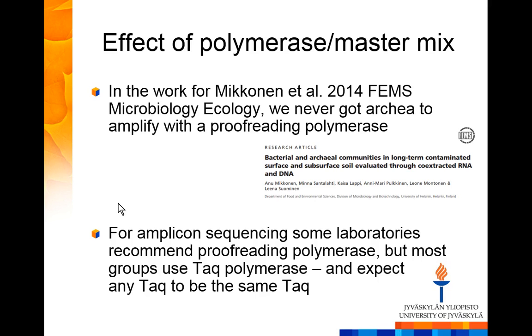One of the challenges was that we never got the archaeal primers to work, or the archaea to amplify, when we used a proofreading polymerase that didn't make so many mistakes and was supposed to detect the targets more specifically. So using this fusion polymerase, that maybe some of you have also used, it never worked for archaea. We tested everything, but then we had to do it with the regular Taq polymerase.